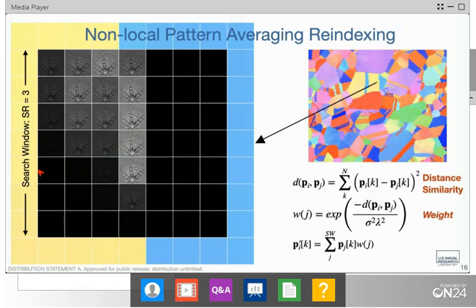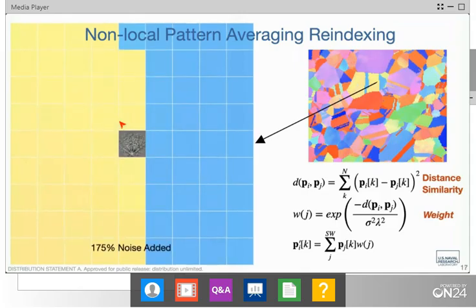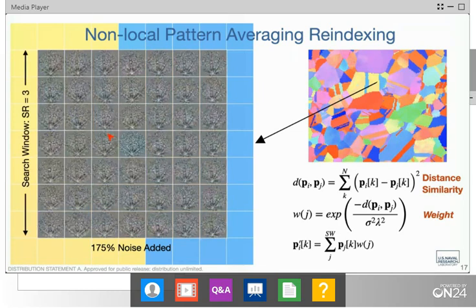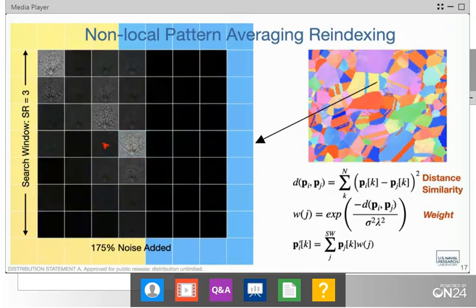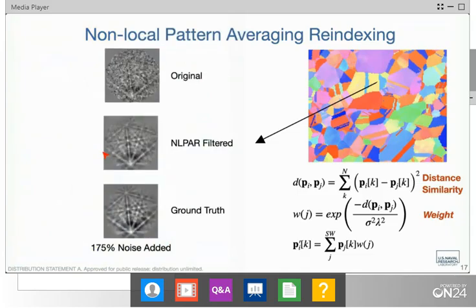And in fact, you see that, again, we're highlighting only the patterns within the yellow grain. We're ignoring all the patterns within the blue grain. Now, if we, again, start adding some artificial noise, we'll see how well the algorithm performs. So again, this is all the patterns with noise added. And you can see it starts to become a lot harder to differentiate exactly which pattern should be there and what shouldn't. But when we run it through the algorithm, it does a very good job. And again, what you really see lighting up are contained within the yellow grain. And if we look at the reconstruction, you can see it does a very good job. It reconstructs exactly the pattern that we'd expect.